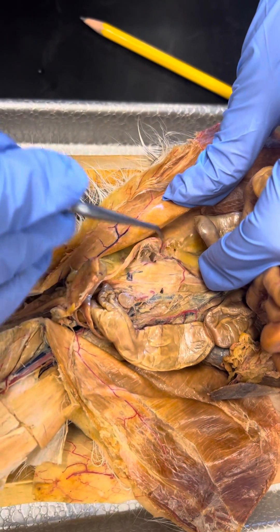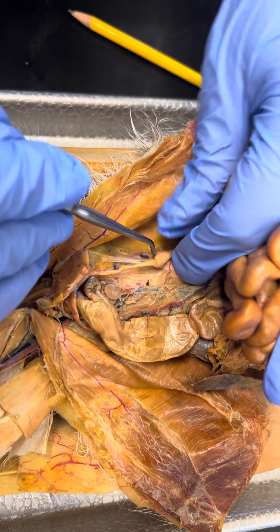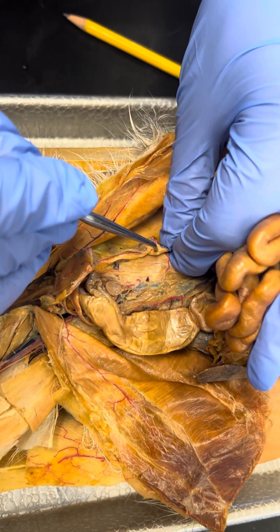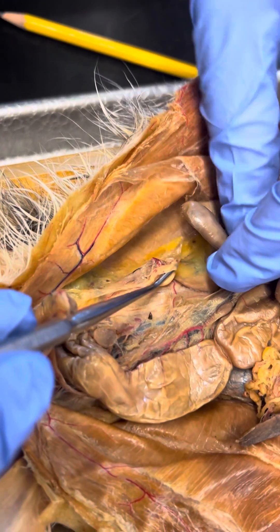This is the ovary — the bean. There's the split, on the other side. This is the infundibulum right here.